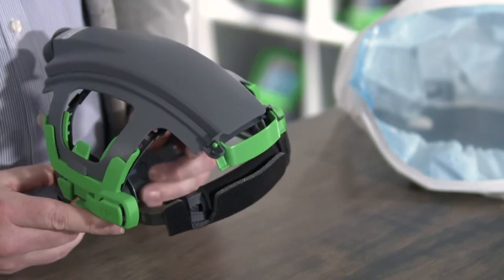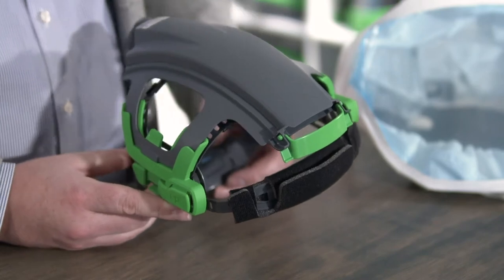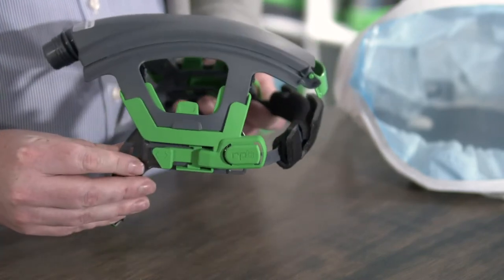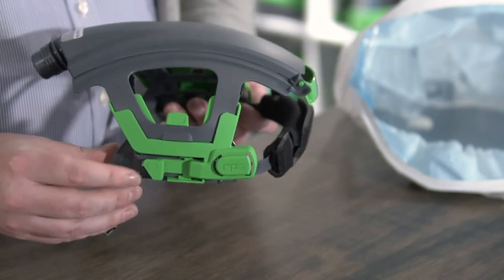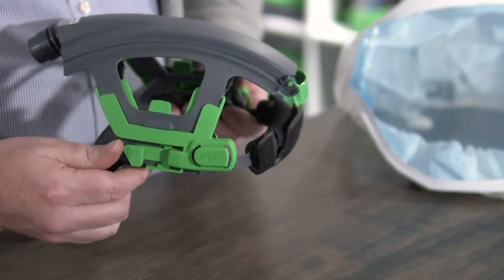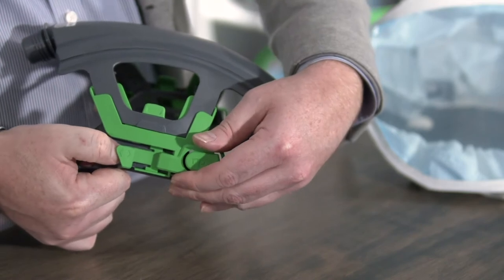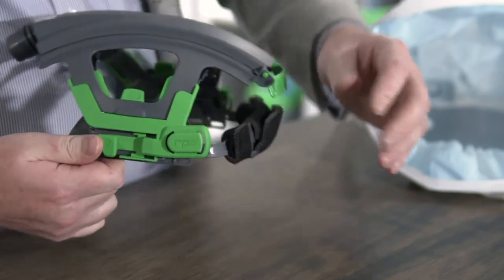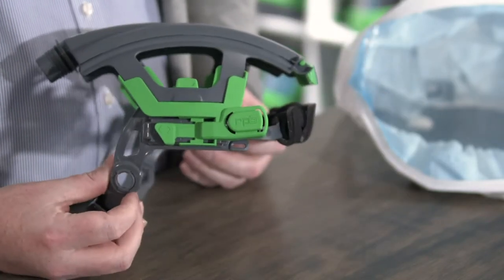There are several ways you can adjust this head suspension to fit perfectly onto your head. Firstly, you can adjust the position of your head within the respirator by adjusting the clips on the side. Simply lift up on the lever at the back and then slide it forward or back to the desired location to give yourself either more or less space at the front of that hood.